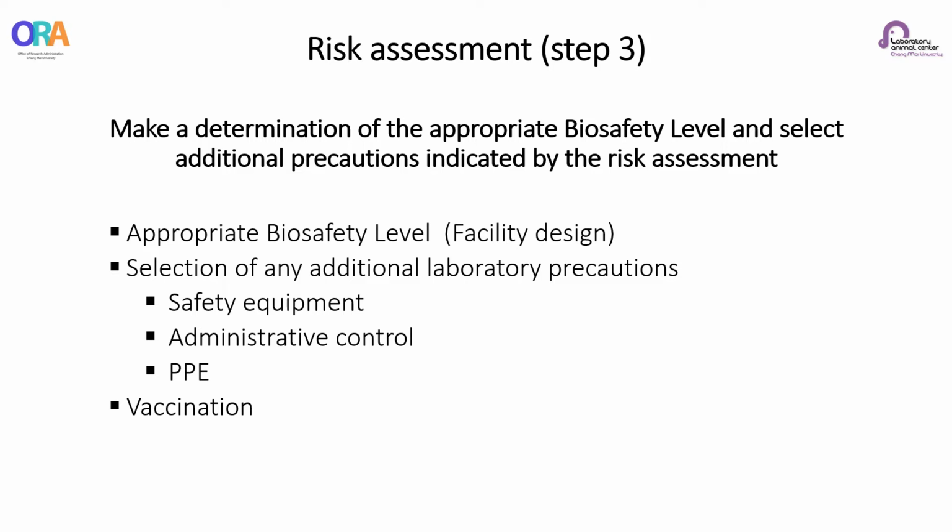And vaccinations may be recommended for laboratory personnel based on safety and availability. However, the protection afforded by a vaccine to an individual depends on the effectiveness of the vaccine and duration of immunity.